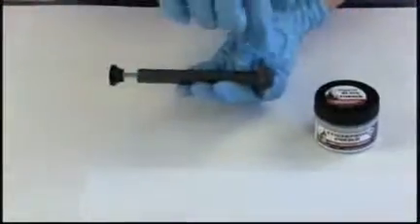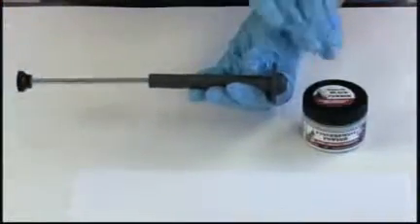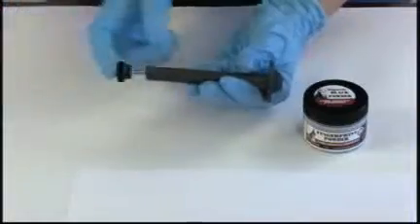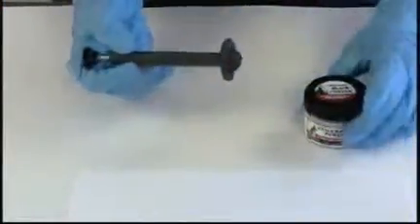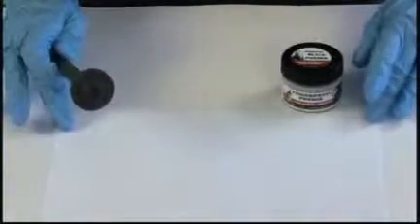When you want to release the magnetic powder at the end, all you do is pull up on the plunger and it should fall right off. So we're going to start with it depressed so that we can pick up our powder, and on this blank sheet of white paper we have some fingerprints to develop.